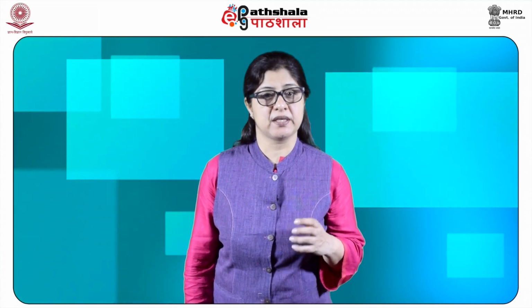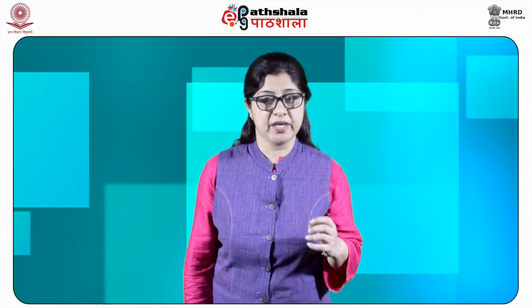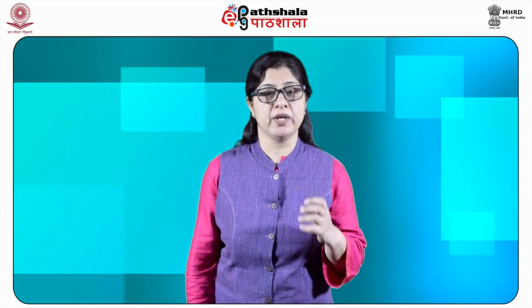This is called the total ion exchange capacity. It is expressed in terms of milli-equivalents per gram of ion exchange resin. The exchange capacity of a cation exchange resin is usually found in the laboratory by determining the number of milligram equivalents of sodium ions which are absorbed by 1 gram of a dry resin in the hydrogen form.